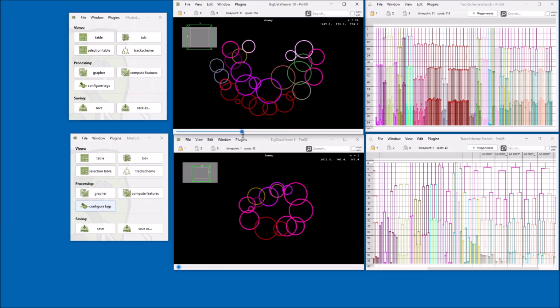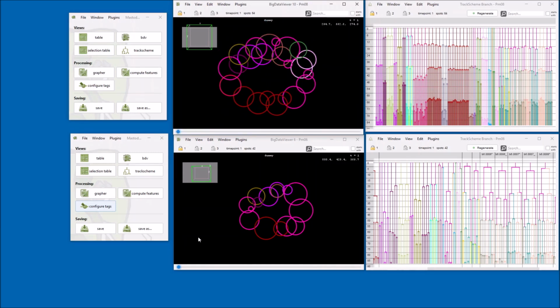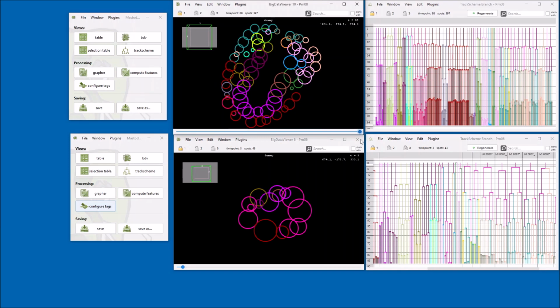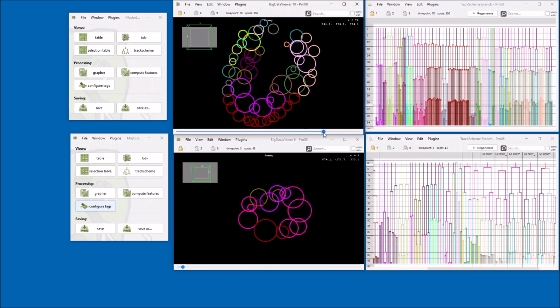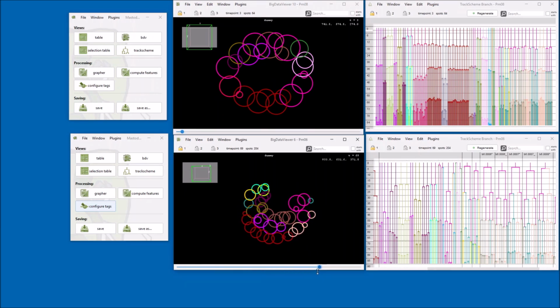So you can see here in this example, this is dataset 8 and this is dataset 6. You can see that they look similar. This dataset goes until the stadium of 300 cells, and this goes even further until the stadium of 400 cells, but it shows similar development. And in total, 10 videos exist.